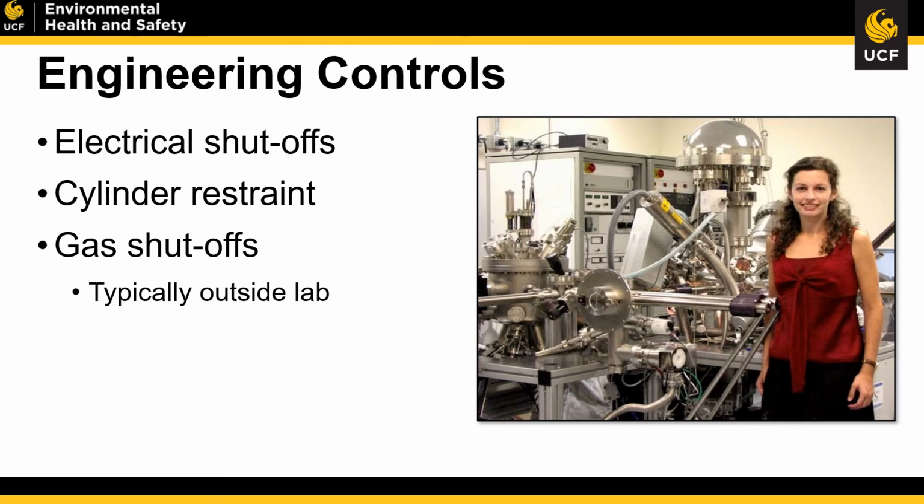An electrical shutoff is used in the event someone is getting electrocuted. So you'd want to engage the electrical shutoff before providing first aid or CPR to the person. A gas shutoff would be used to shut off a gas leak. Say that one of your main bench tops has lost control of its shutoff valve. You'd go to the main gas shutoff, which is located typically outside the lab because we don't want you entering a hazardous space that's filled with gas, and shut that valve.